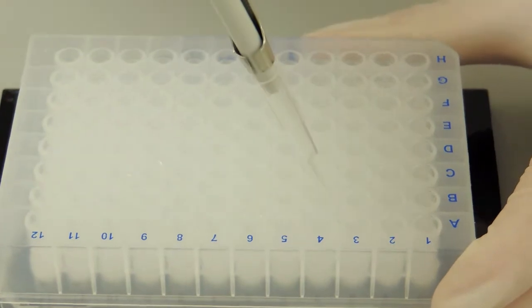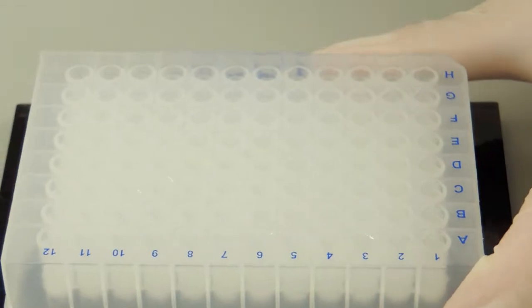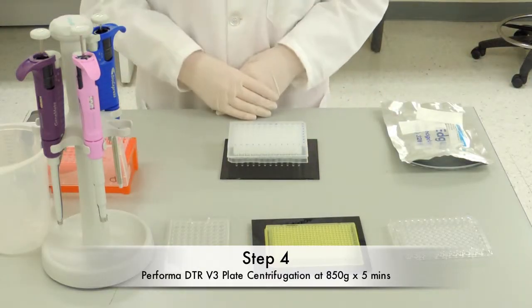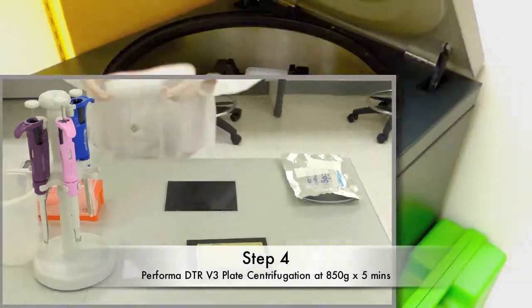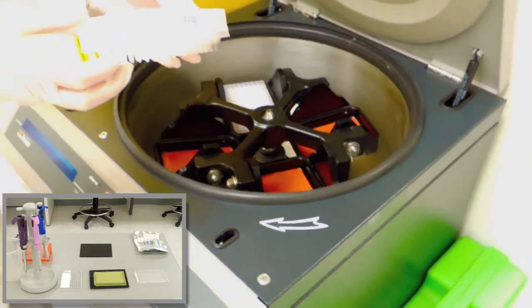Samples are loaded directly onto the center of the column. Once you are finished loading your samples, the Performa and Capillary plates are once again sent off for centrifugation at 850 Gs, but this time for 5 minutes.